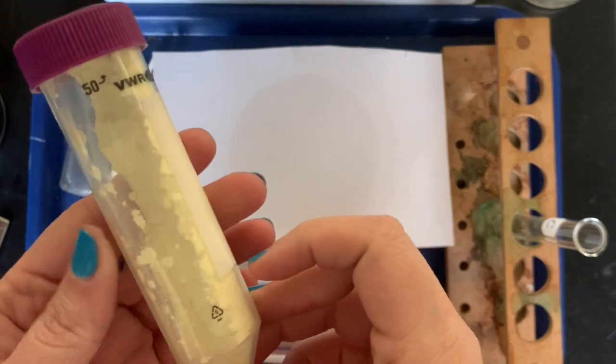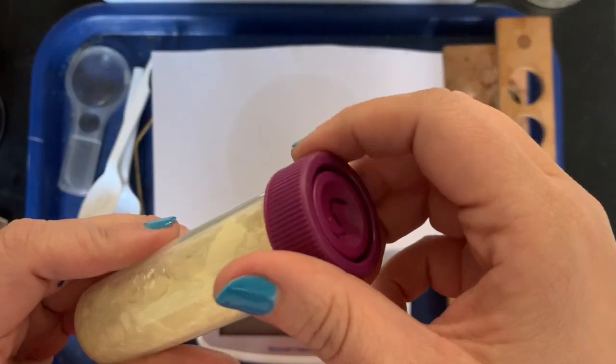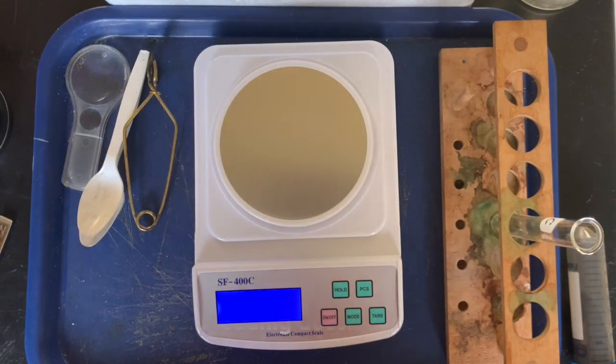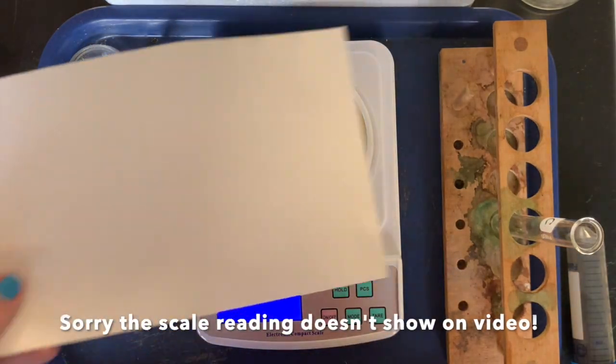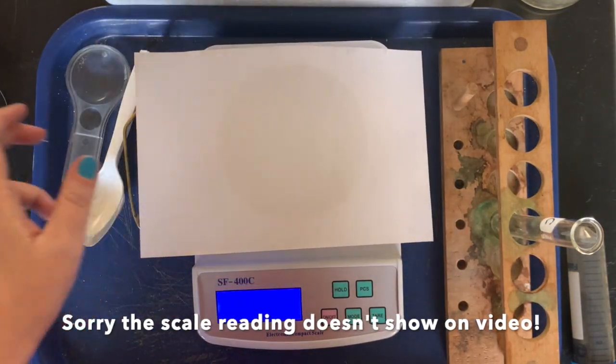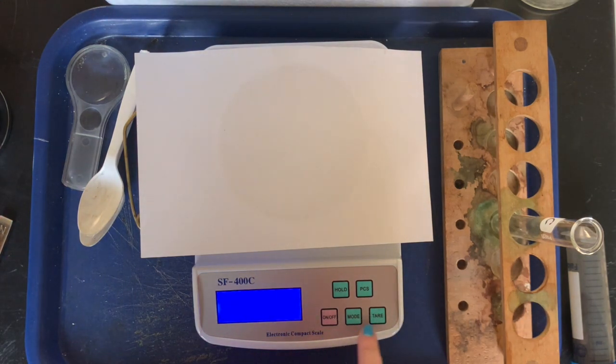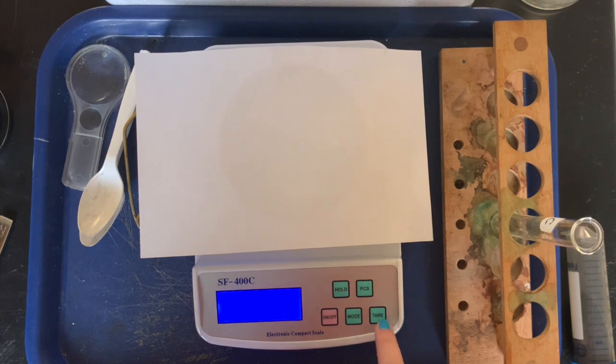All right, cool. So we're gonna measure out four grams, you said. Okay, so I've got my scale turned on and we're gonna use this paper so we're not putting sulfur right on the scale. It's got a mass of 2.37 grams, but I want to start it at zero so I'm just gonna press the tare button. There we go, and now we're at zero.